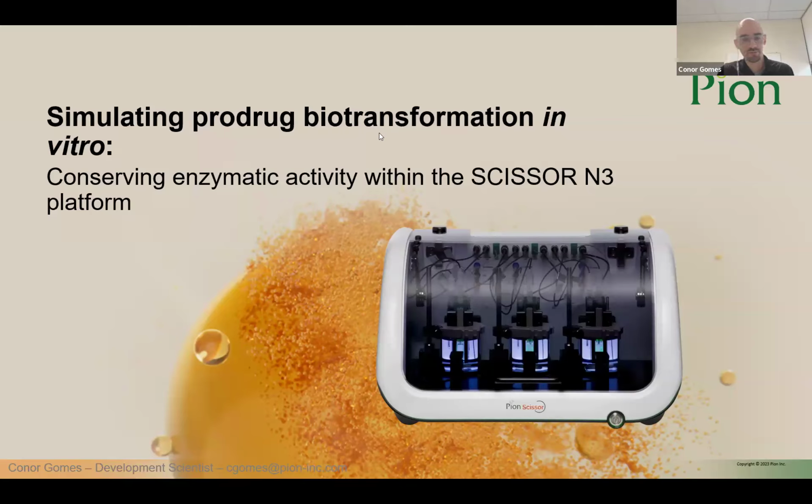Thank you very much for the introduction, Maura. Again, I'm Connor Gomes, the lead developer on the SCISSOR instrument, and I'll be talking today about how we're developing an assay to simulate the prodrug biotransformation in vitro and conserving those enzymes that cause that biotransformation within our SCISSOR platform for use with prodrug injectates.